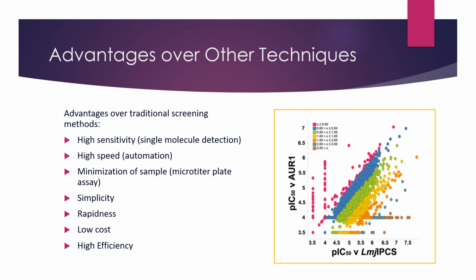The figure on the right is showing the dose response of the initially identified 4,166 selective hit compounds. This is just an example of how many hits can be generated using HTS. In this particular paper, over 1.8 million compounds were screened.